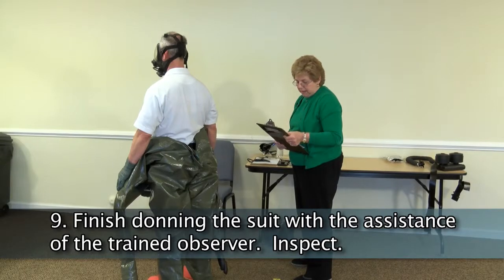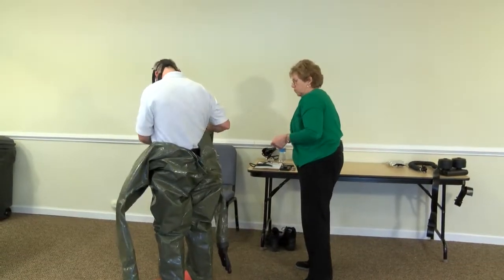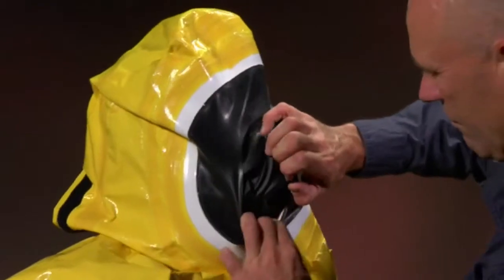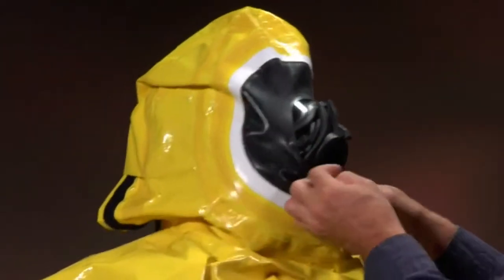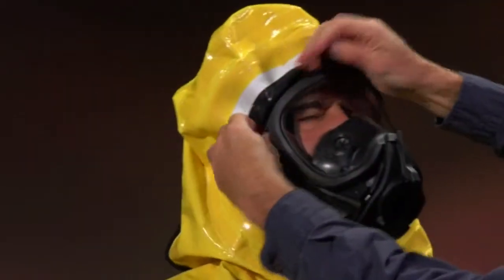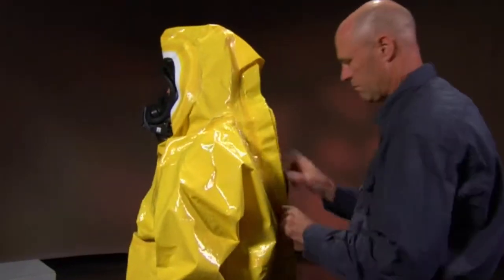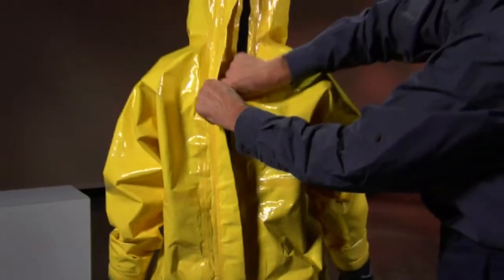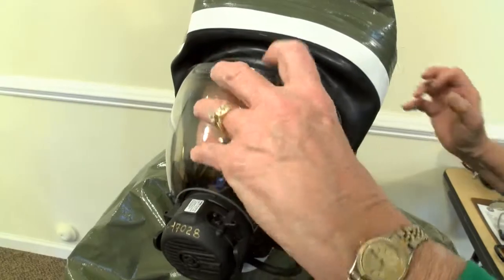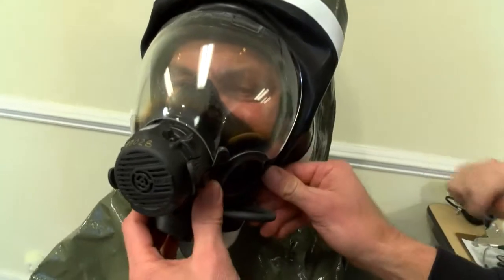Don the suit and zip down with the assistance of the trained observer and inspect. For the level 2 suit, place the arms into the sleeves and gloves. The provider will need assistance fitting the suit over the APR. Start by inserting the lower edge of the APR through the opening in the hood. The trained observer shall insert fingers to work the seal around the edge of the face piece of the APR. Once the suit is fitted over the face piece, the trained observer will zip the suit and connect the Velcro storm flap. It has been noted that fitting the suit and face piece may result in movement of the face piece; therefore, the seal of the APR should be verified following donning.